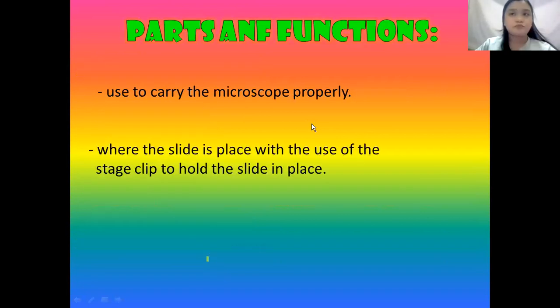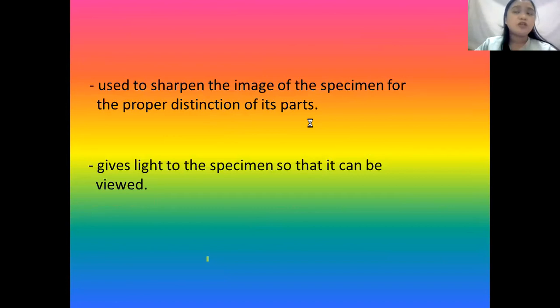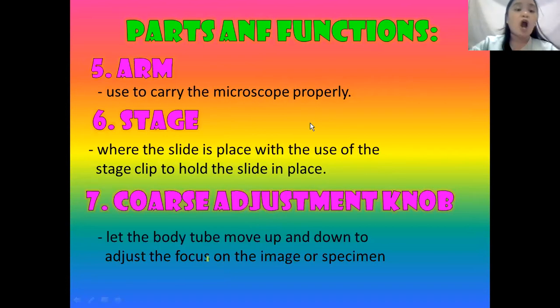Next, we also have here, okay, the arm. Okay, what is the function of the arm?